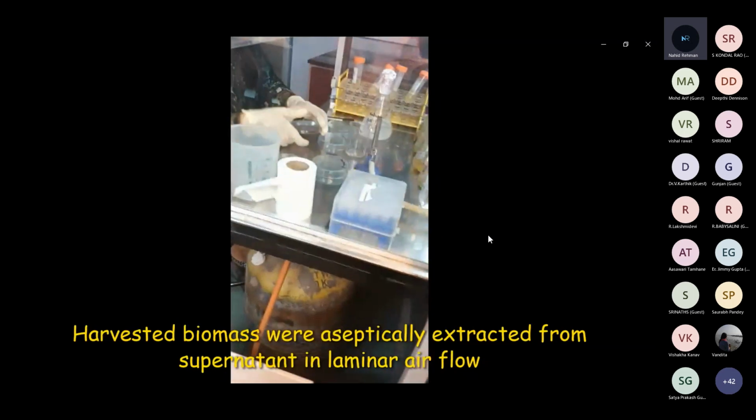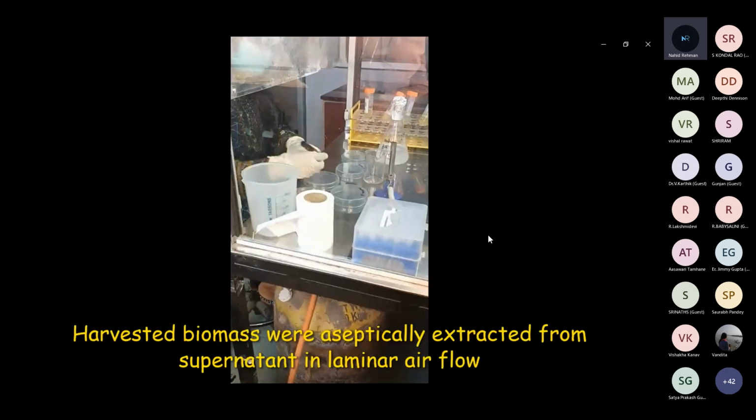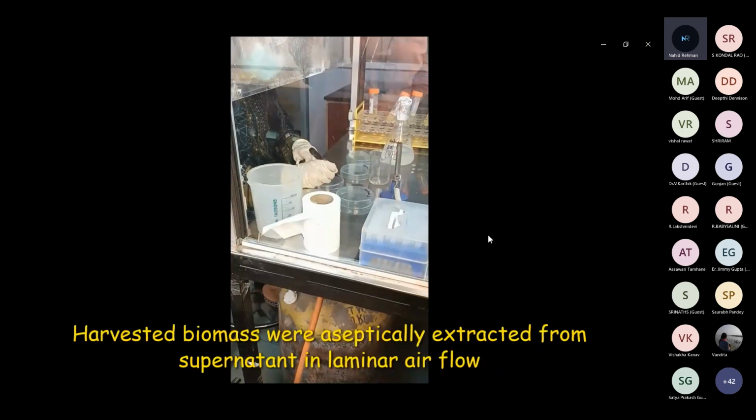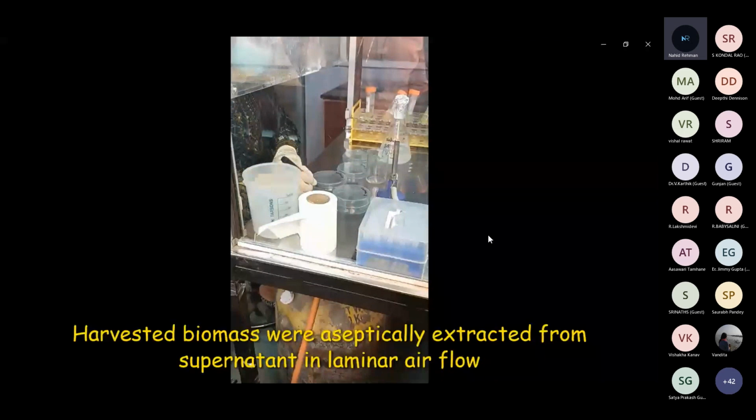She is opening the lid of the petri dishes, and she's putting some labels over that. This time she is using the glass petri dishes.